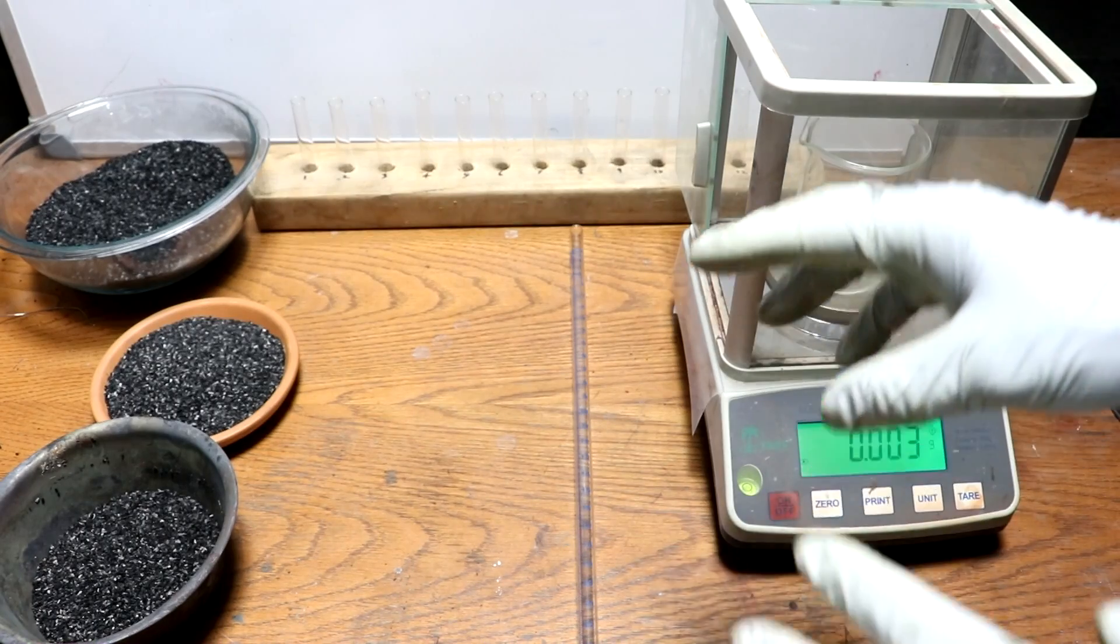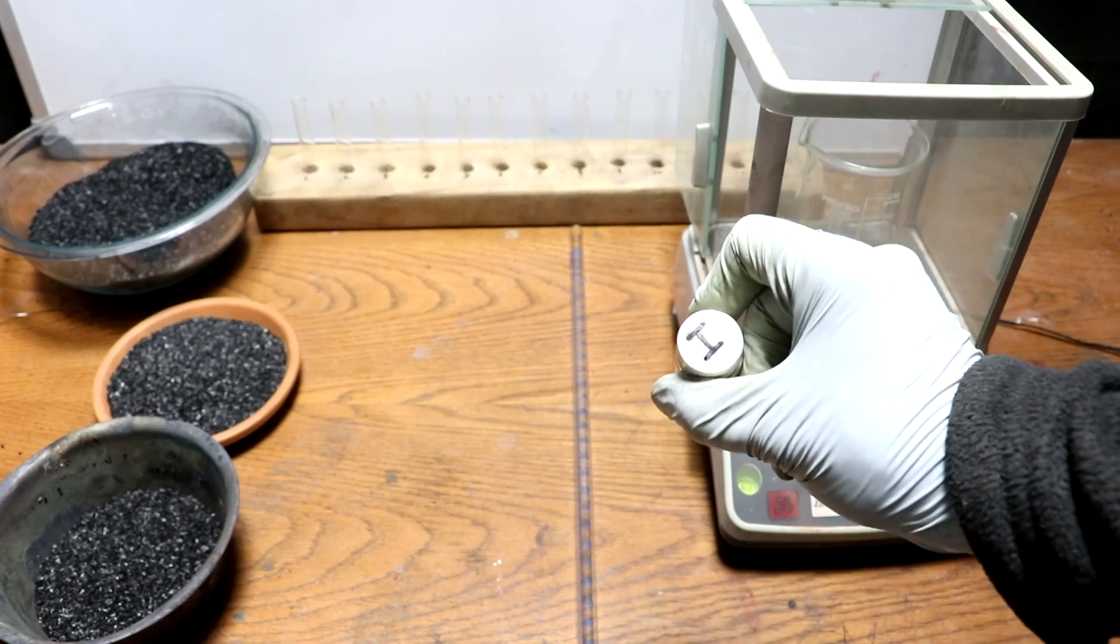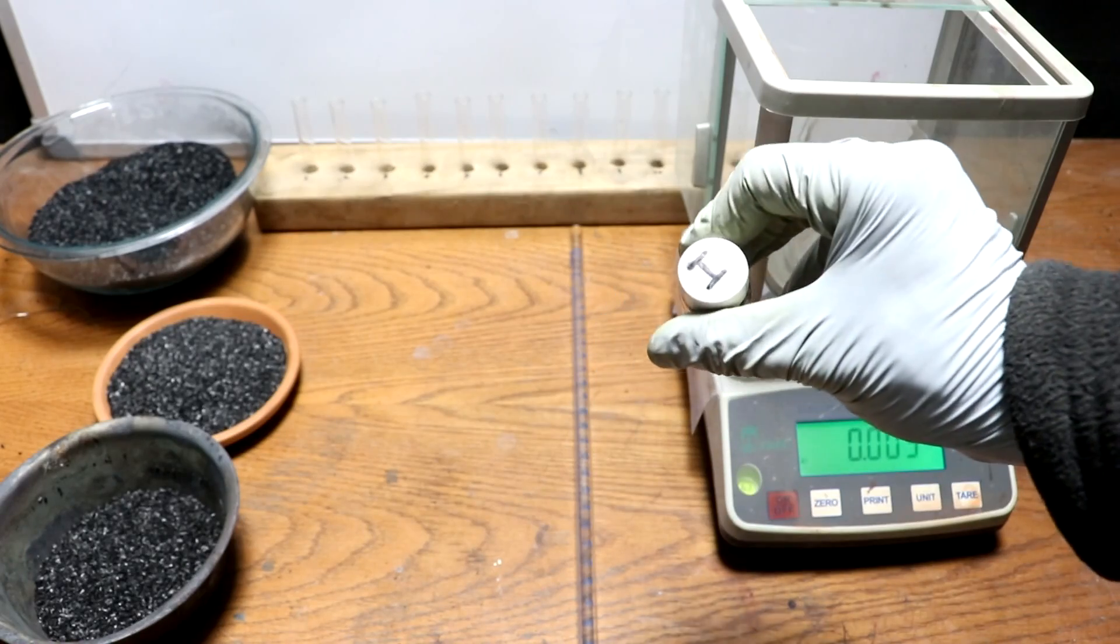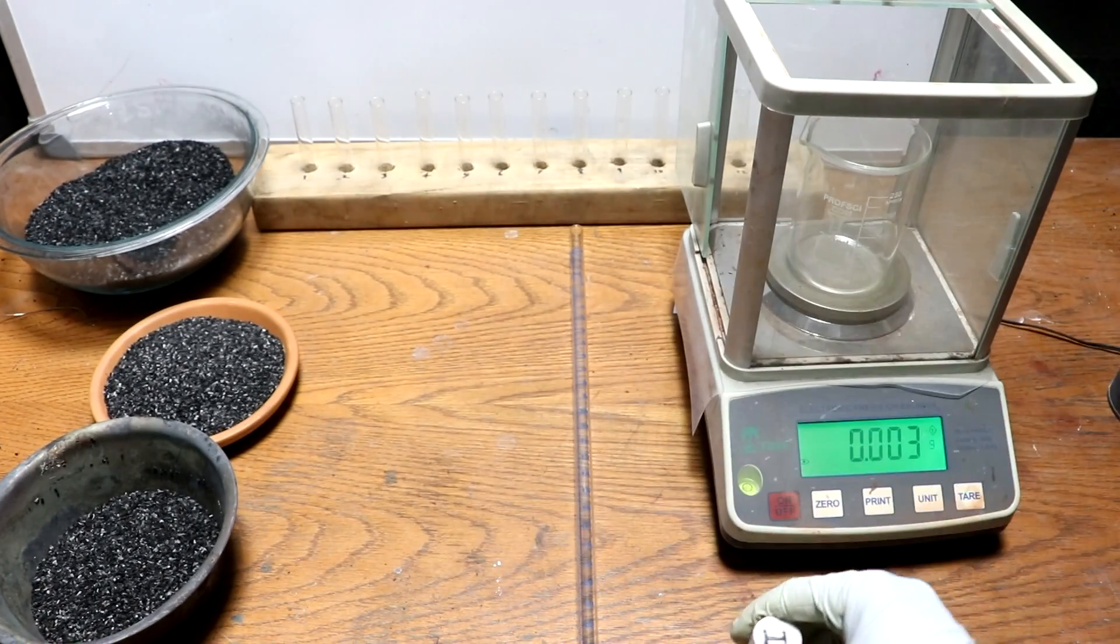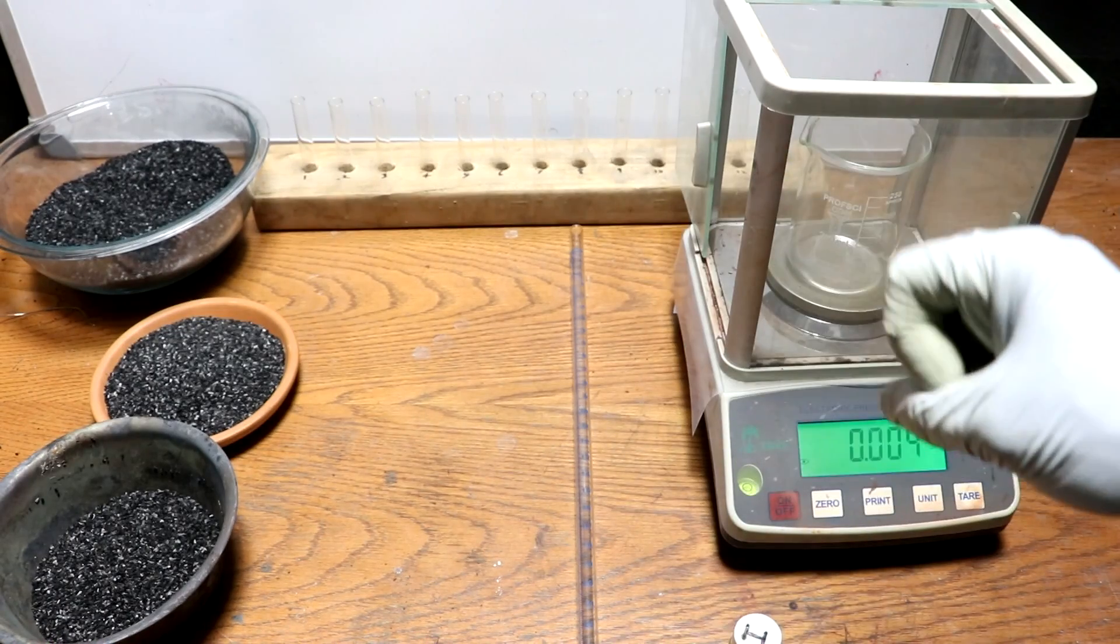So what I'm going to do to test the charcoal is pretty much just see how much iodine it can absorb. So how many milligrams of iodine can a gram of charcoal absorb? The more iodine the more surface area. They should be directly related.